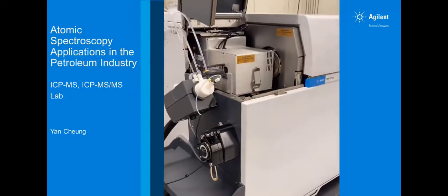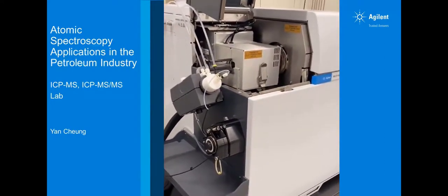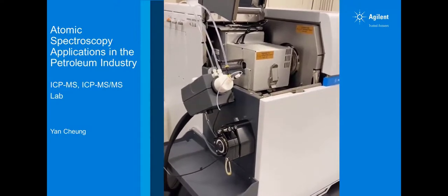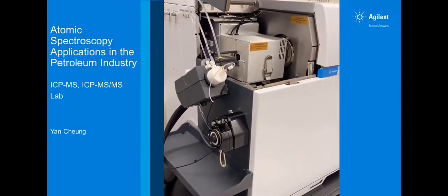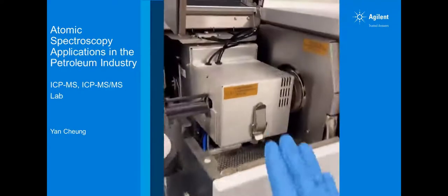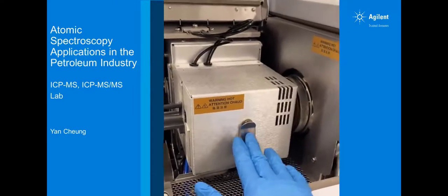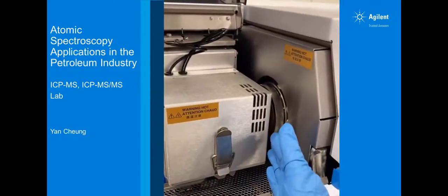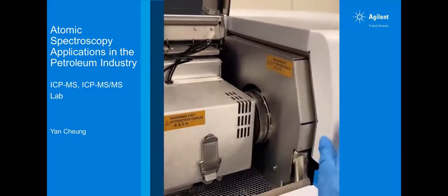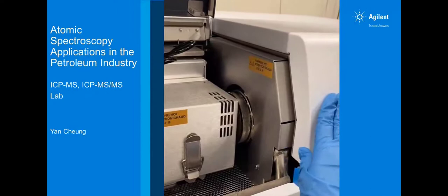Okay, now I think I have gotten my instrument ready for organic solvent. I have the 20% oxygen, 80% argon mixed gas plumbed into the instrument. I have the torch with a smaller injector installed, a sampling cone and skimmer cone, both with the platinum tips, and the X lens with the brass base.